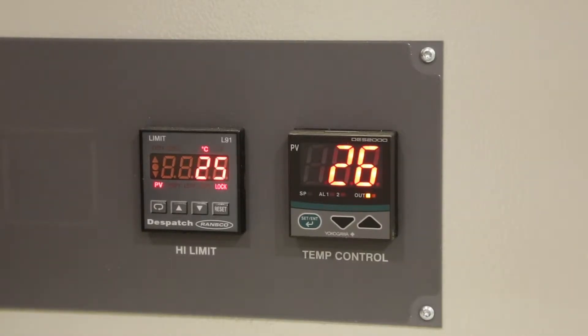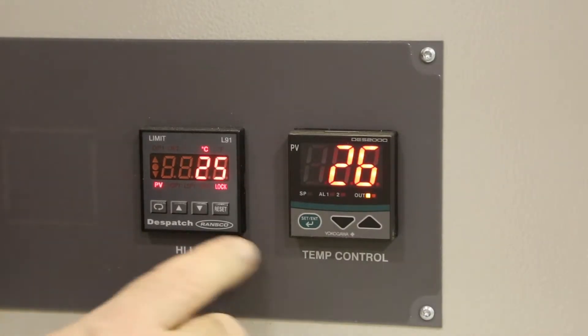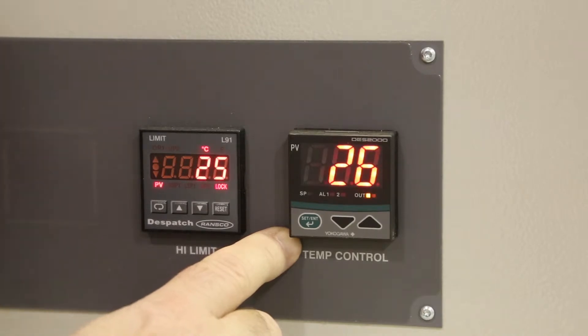This video will show you how to change the DES-2000 controller on the Despatch LBB oven from centigrade to Fahrenheit.